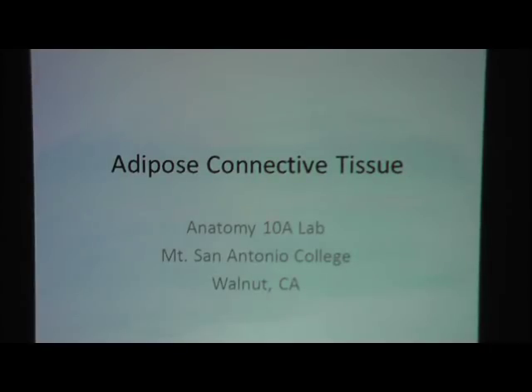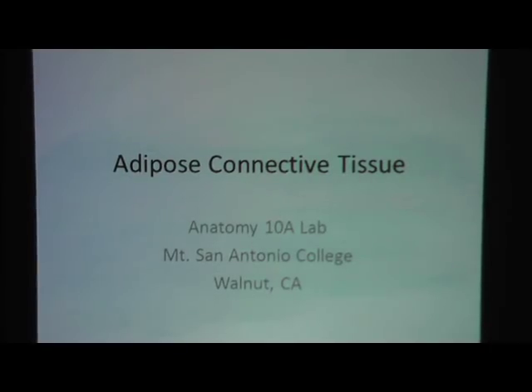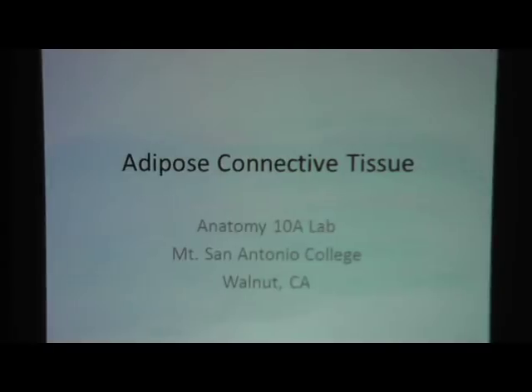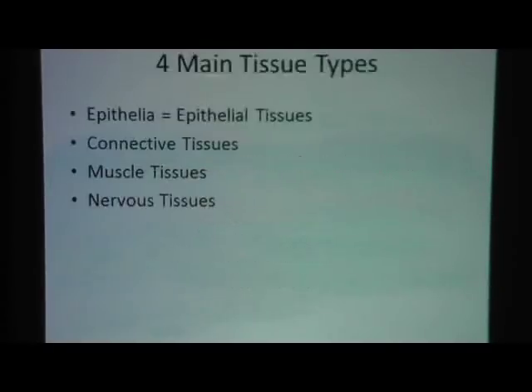Adipose connective tissue. These slides are made for Anatomy 10A lab at Mount San Antonio College.